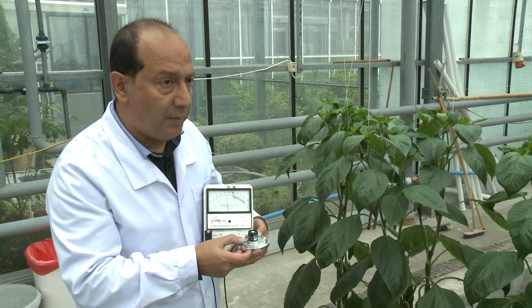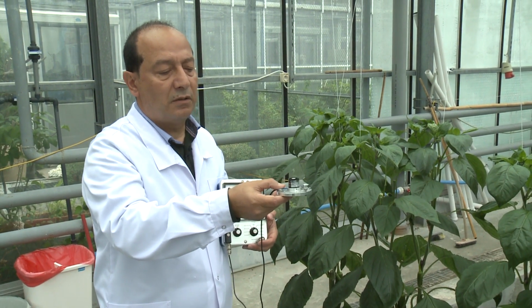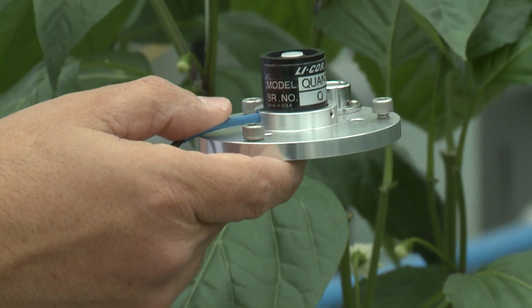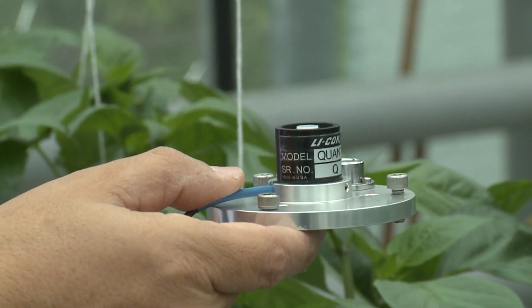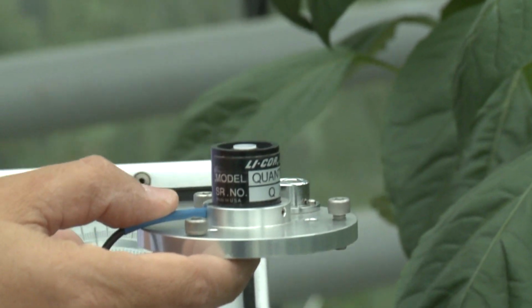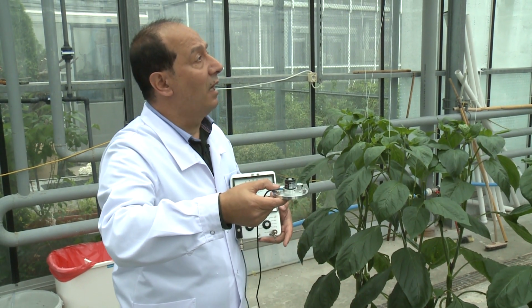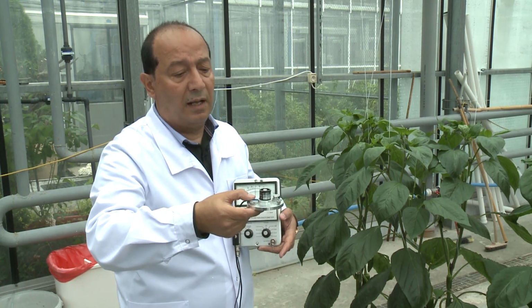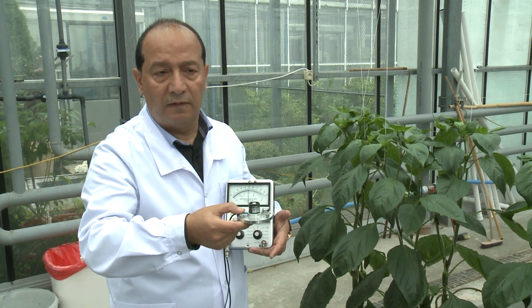So to do our measurements, please remember that if you are in a closed place like here in the greenhouse, you first have to make the sensor horizontal. This is why we have the leveling units here. And keep it away from us and from any other objects which can affect our measurements. So we can make the measurements peacefully, doing one point, then we go to another place in the greenhouse, and we do many points, then we can take the mean value. Because we cannot trust only one measurement, as you can see, there are various elements above us related to the construction of this building. So we have to do multiple measurements, then we can take the mean value.